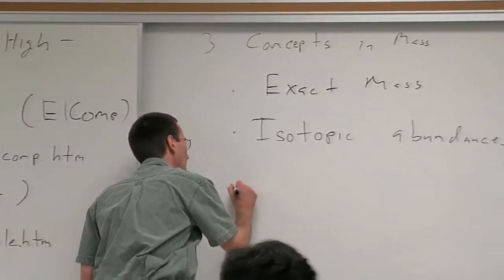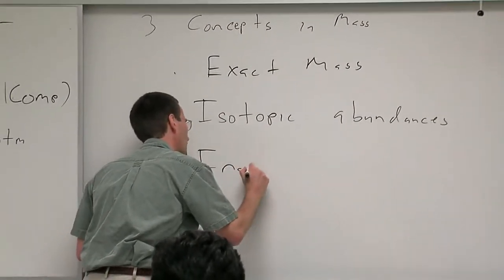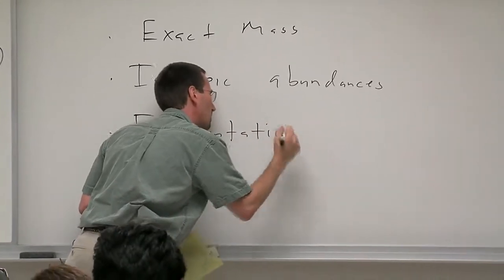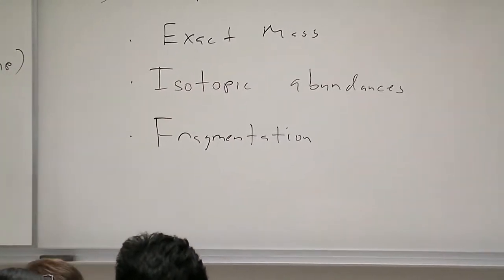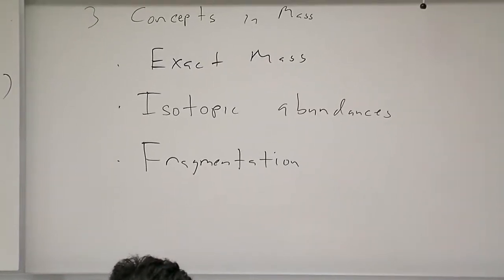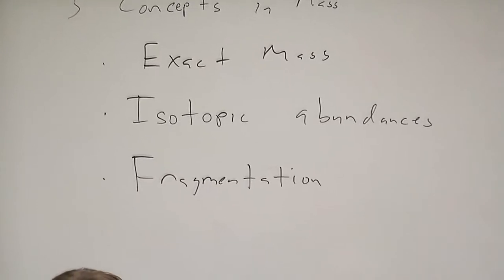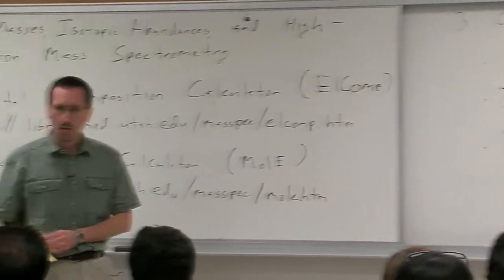And then in the last lecture, we'll talk about fragmentation. So this will be on Wednesday's lecture. We'll discuss fragmentation as it pertains to EI mass spec, which is really a special topic in its own right.